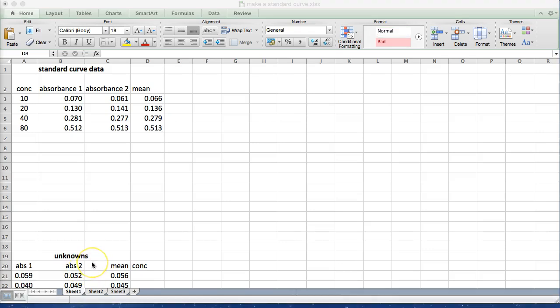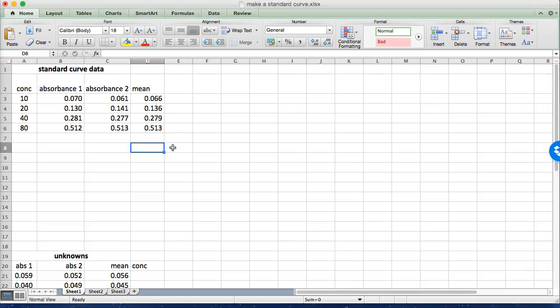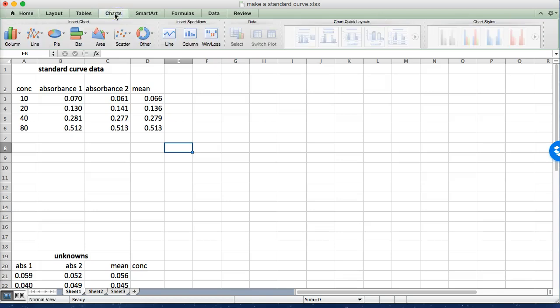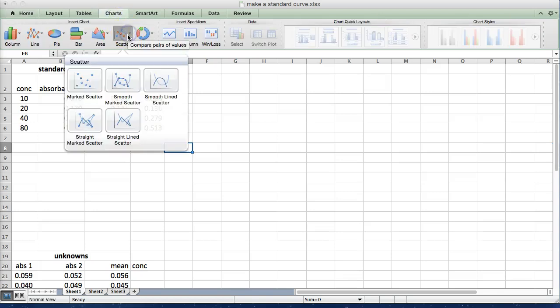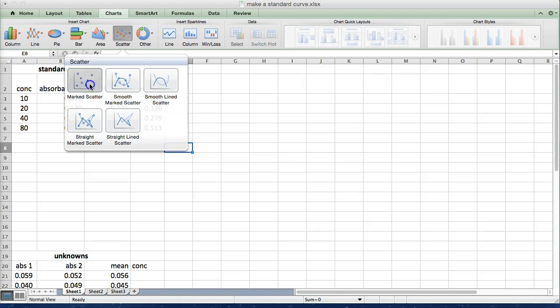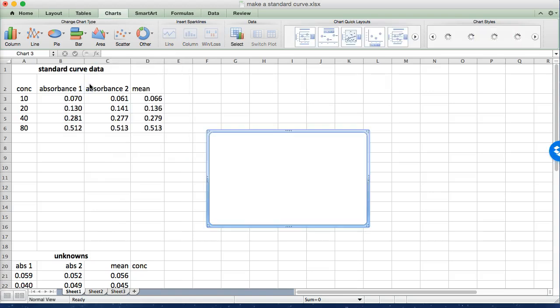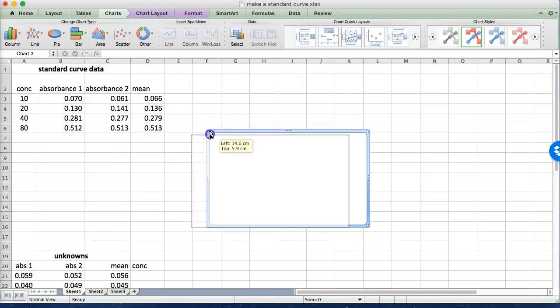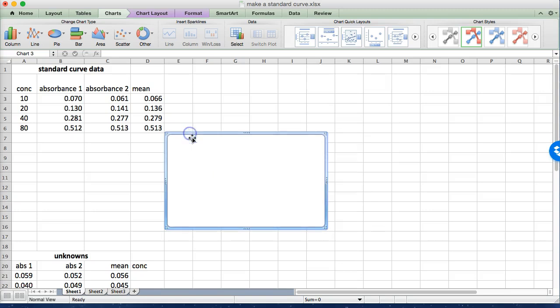So we're now ready to create our graph. The graph we want to use here is called a scatter plot. So we just click somewhere that we would like the graph to show up and change to our chart tab. We want the scatter plot. We don't want to join the lines in this particular plot because we're going to be adding a trend line and that's the only line we're really interested in. So we'll use marked scatter plot.